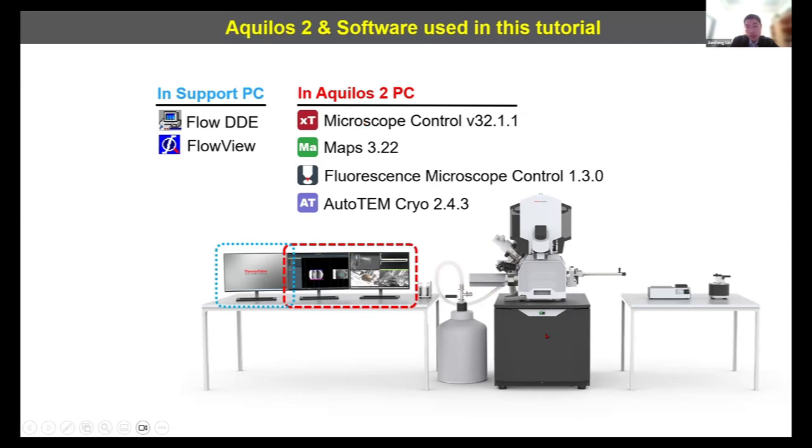In this workflow, I will introduce the 4 software programs, and in each step I will highlight which software is used. Beginners may feel confused by so many programs, but after some practice you will find it really straightforward because the workflow is also relatively simple.